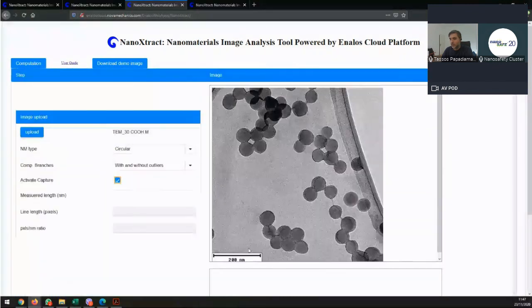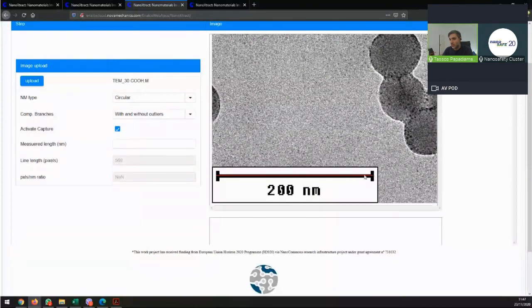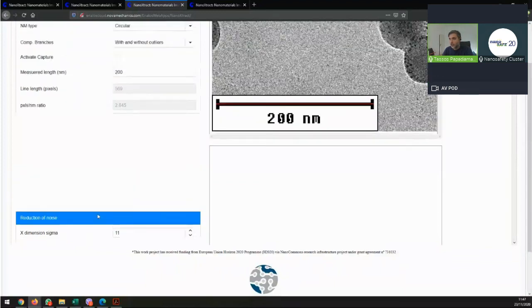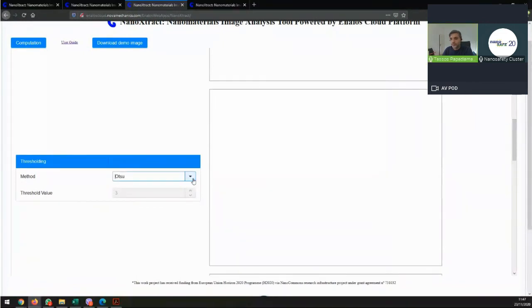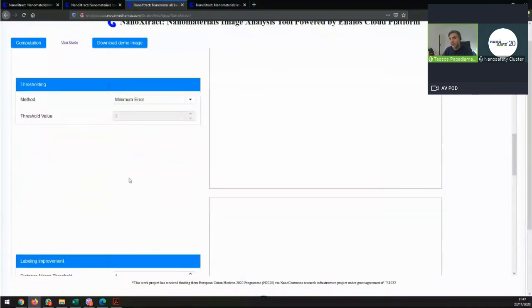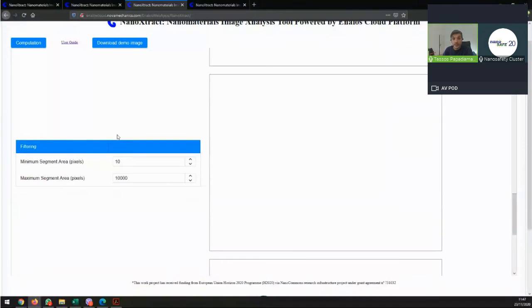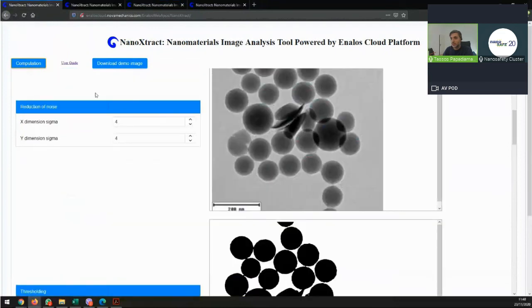Okay, apologies about that. I'm increasing the background here because I want to cut the top right corner, where it has what I take to be the sample edge. Let's run this now.